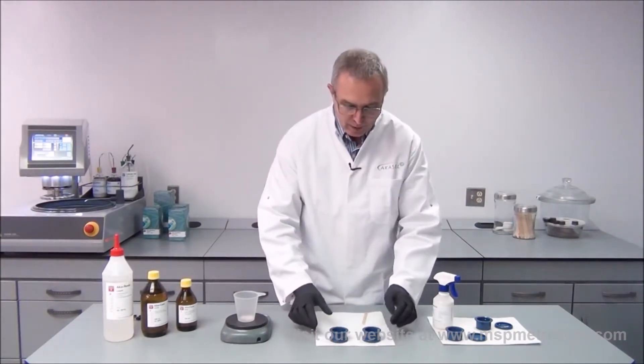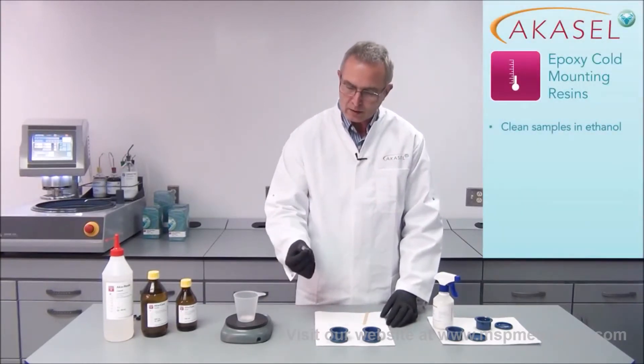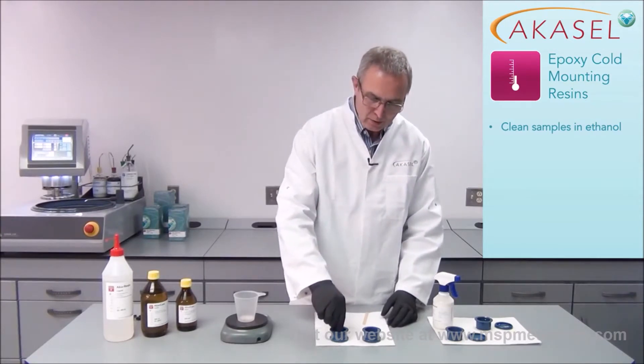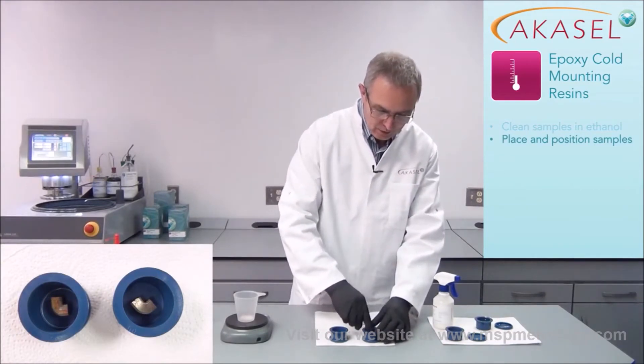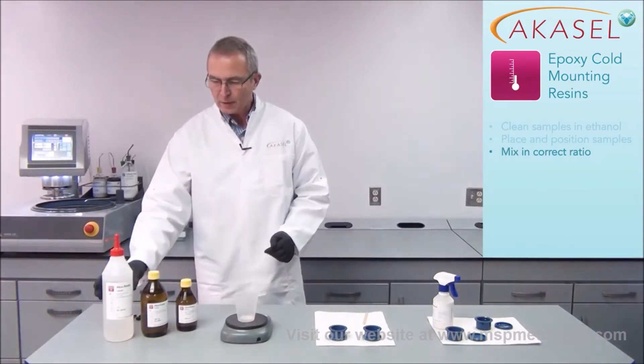I've already prepared two mounting cups so they are ready for use, and I've also already cleaned the samples in ethanol, because they have to be cleaned to make the resin stick perfectly. I put them in the mounting cup and adjust them to the center of the cup, and then I can start mixing the resin.